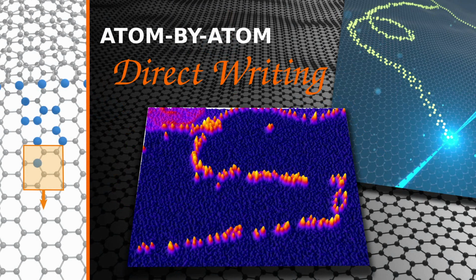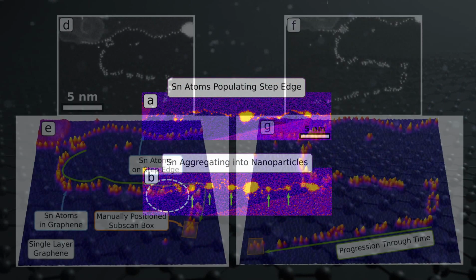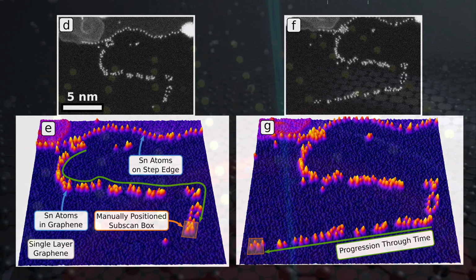graphene at high temperature. In that work, the tin atoms were induced to spontaneously diffuse along a graphene step edge through thermal excitation and supply the requisite source atoms without requiring any action by the beam. That demonstration was confined to start at the step edge where the mobile tin atoms were located.